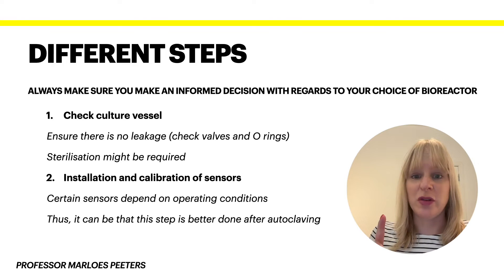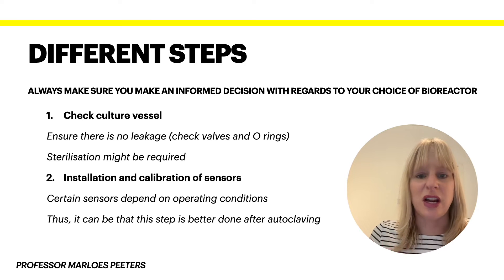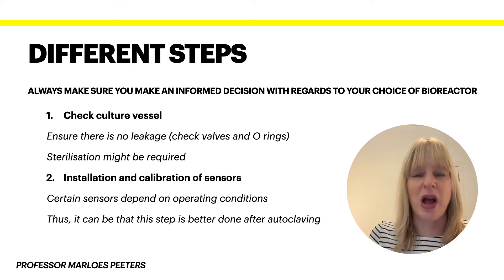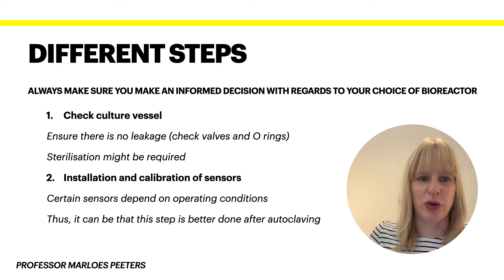The first thing to do is to check the culture vessel. A very critical thing that can go wrong is that there will be some leakage somewhere around the tubing. So it's critical to check the valves and the o-rings which ensure that the whole system is sterile. Even then you might need to sterilize it to make sure that there's no blockage anywhere or any traces remaining from the previous reaction — which is why autoclaving is so important.